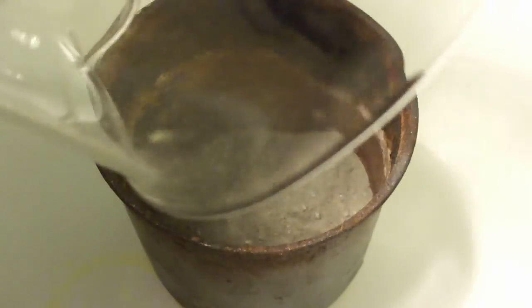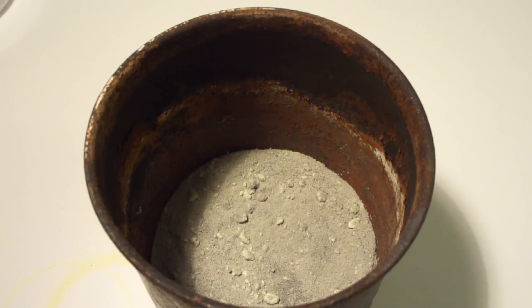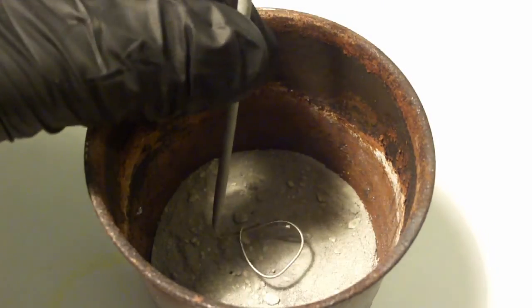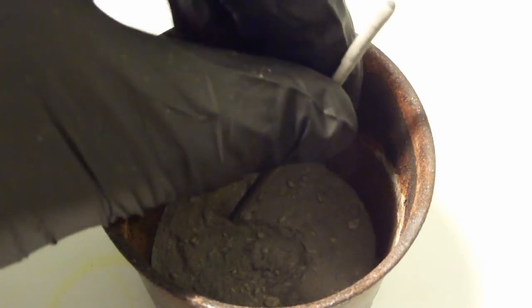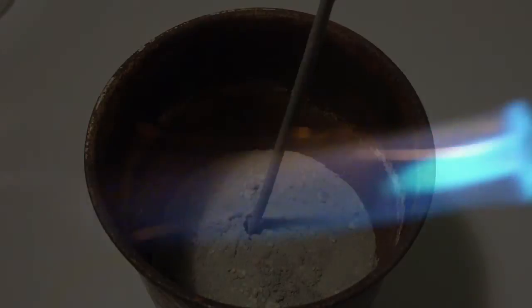To ignite it, insert a sparkler. Now, time for the action. Make sure to wear PPE for this. Light the sparkler and step back.